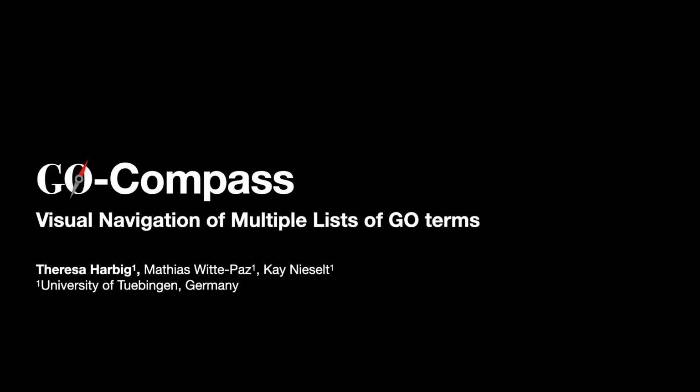Hi, my name is Theresa Harbig from the University of Tübingen, and today I'm presenting GoCompass, a tool for the visual navigation of multiple lists of gene ontology terms.